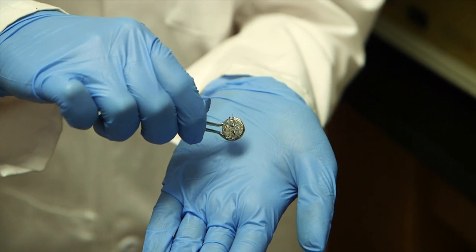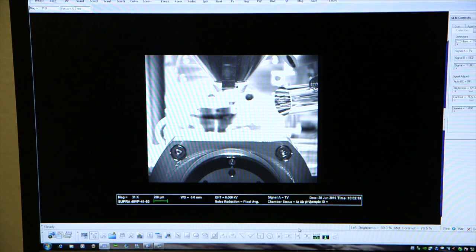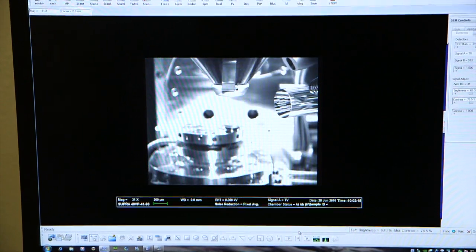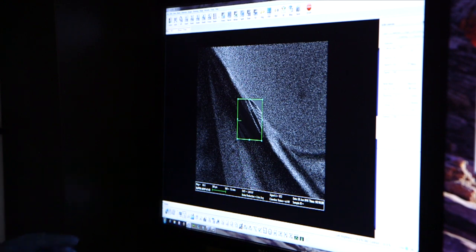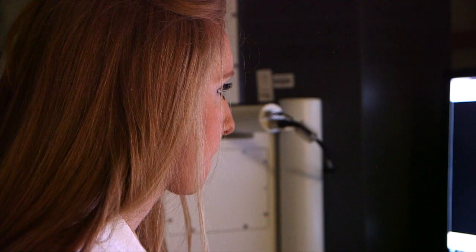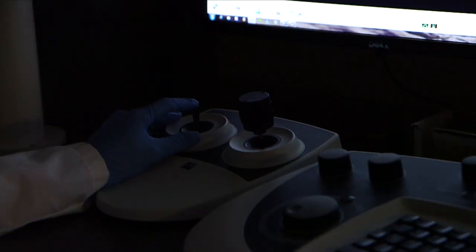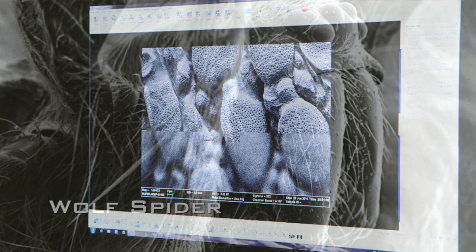Finally, the stubs can be viewed by the electron microscope. The crown jewel we have now is a Zeiss Super 40 VP scanning electron microscope, or SEM. After a bit of fine tuning — right now we're magnified 66 times — you can already see very fine features on the snake skin. Details become more and more amazing as the microscope zooms in further; this is magnified 1,800 times.